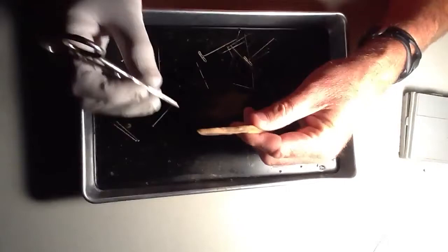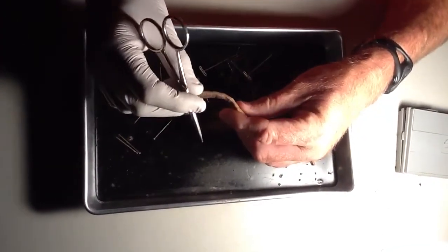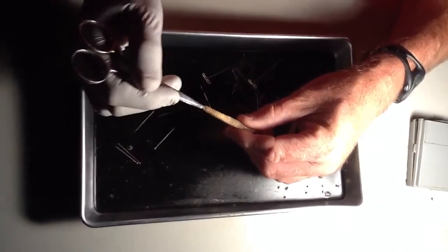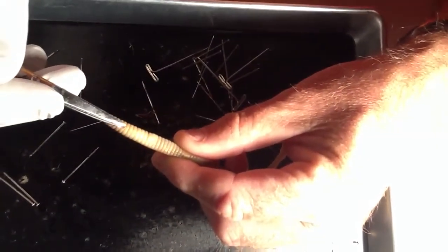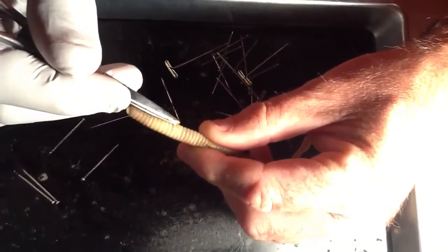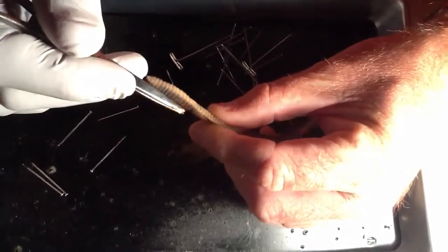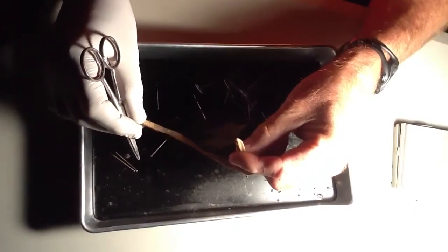All right. So you have the mouth. You have the clitellum, which is on your list. You have a genital pore, which if you look down, you can actually count 1, 2, 3, 4, 5, 6, 7, 8, 9, 10, 11, 12, 13, 14, 15 segments down. You'll see the segment has a little hole in it. That's the genital pore. And then, of course, at the other end, you have the anus. Does that make sense to everybody?